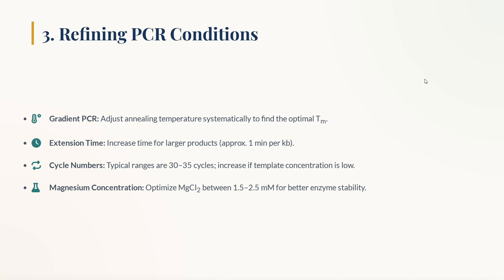With the annealing temperature, of course, you will get a clear picture whether your primers are binding properly at 57 degrees or they will bind at 65 degrees. So you should put one gradient PCR to get a proper temperature gradient, right? Then accordingly you can select which one gives me proper bands without any dimers and without any non-specific binding. Then I'll go for the next step.